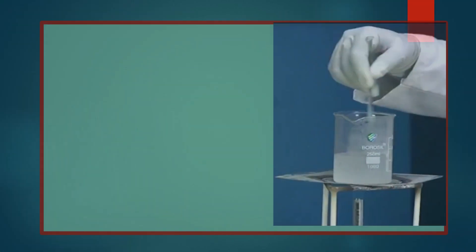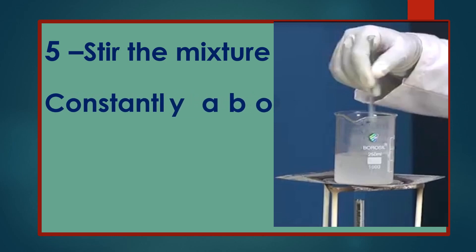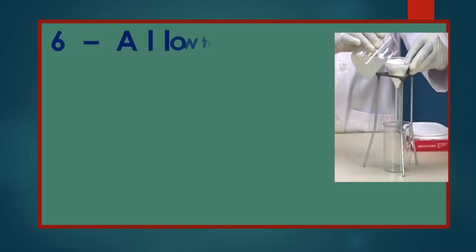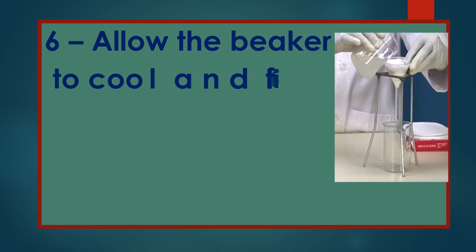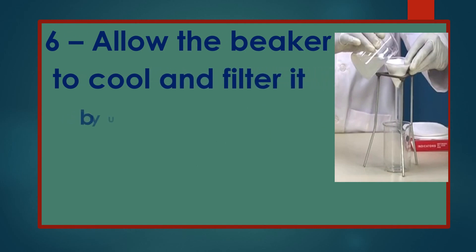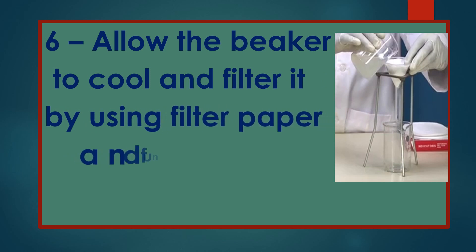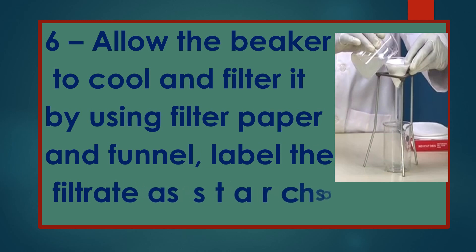Stir the mixture constantly for about 5 to 10 minutes. Allow the beaker to cool and filter it by using filter paper and a funnel. Label the filtrate as starch sol.